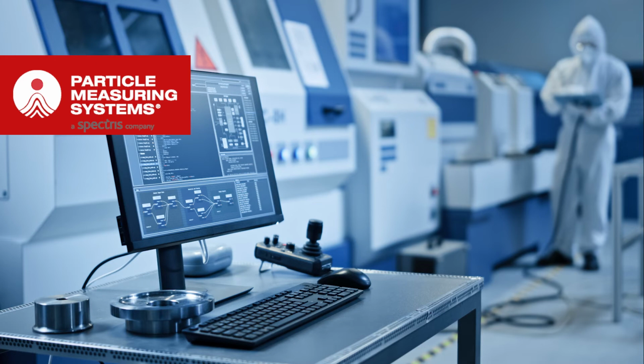And then finally, you have the detectability. Well, what we're talking about is a monitoring system, and monitoring systems are inherently the detection device. You can not necessarily ignore, but accept as critical the severity and the detectability and focus more on the probability. So when we start to look at our risk assessments, probability is really where it's at.